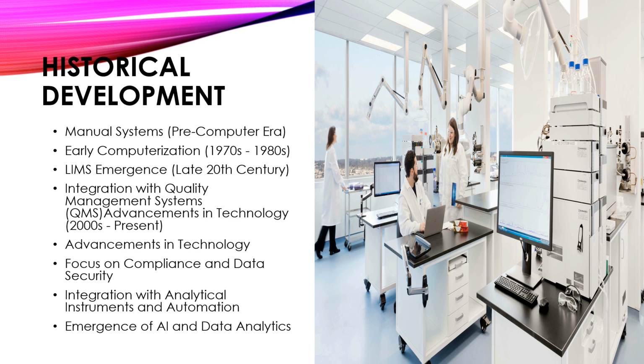First, manual systems. Before the advent of computers, laboratory management was largely manual. Laboratories maintained records using paper-based systems, which were labor-intensive and prone to errors. Data recording, analysis, and reporting were time-consuming processes. This we can call the pre-computer era.